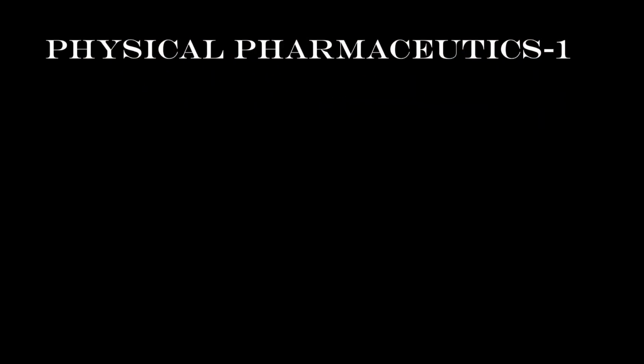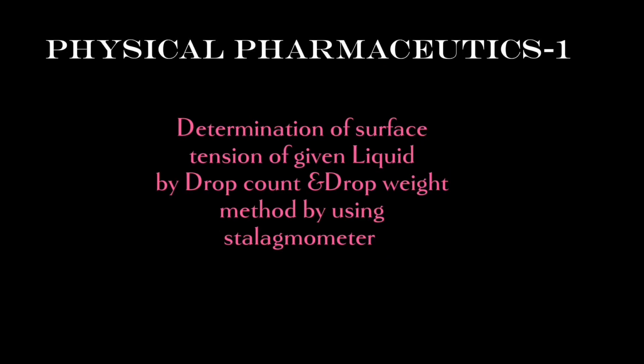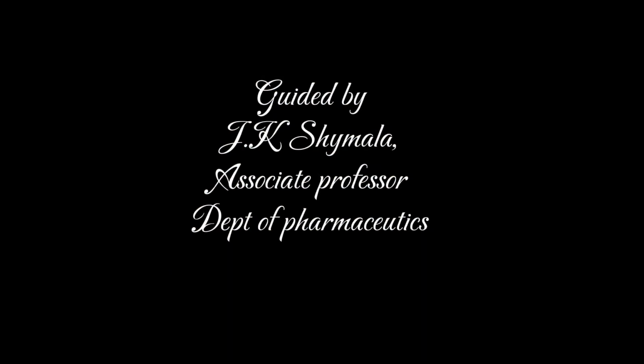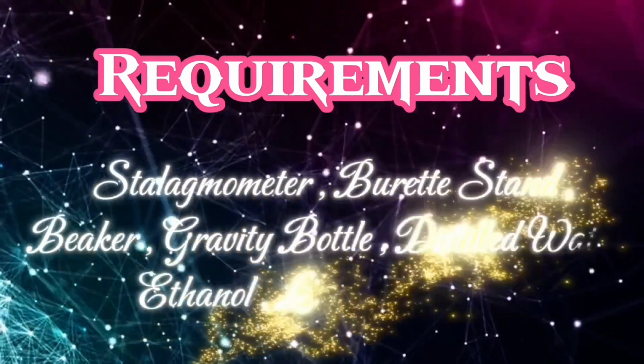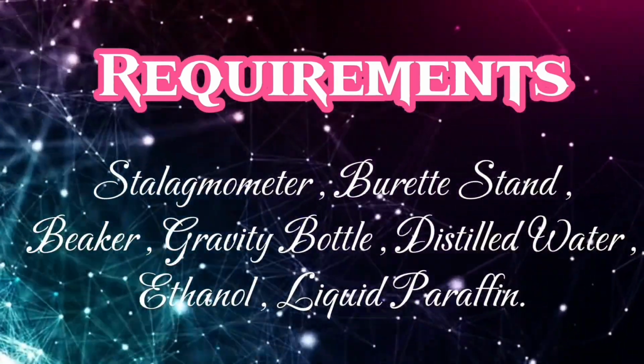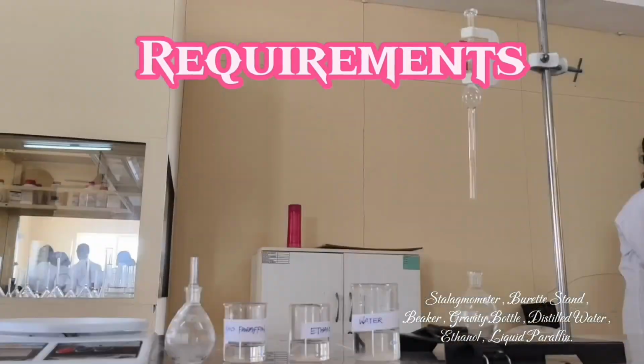Hello guys, today we are going to do the experiment: determination of surface tension by drop count method and drop weight method using stalagmometer. Requirements: stalagmometer, burette stand, gravity bottle, distilled water, ethanol, liquid paraffin and beaker.